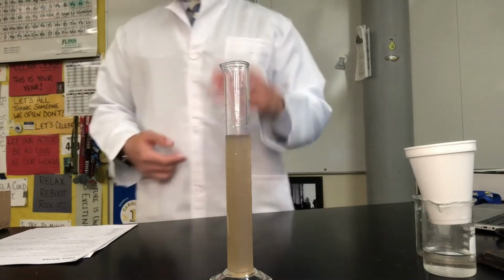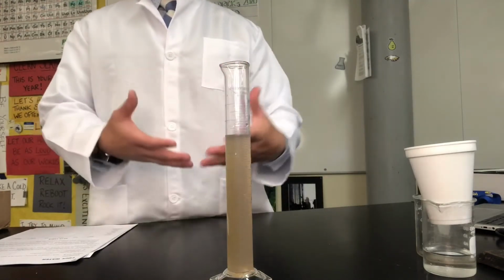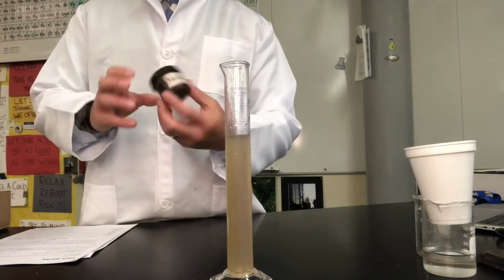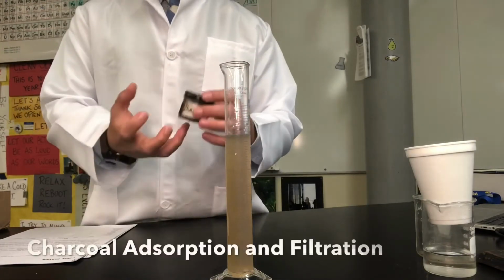the oil. Let's see if we can clarify this, meaning that we can get this a little clearer so that it doesn't have a color to it, maybe get rid of an odor in that. And to do that, the key ingredient is going to be charcoal. So we're going to actually swirl this around with charcoal, mix it up good.